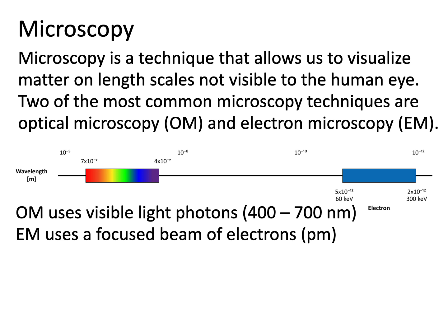Light microscopy uses visible light photons, right? That's between 400 and 700 nanometers on that ROY G. BIV spectrum, whereas electron microscopy behaves in a lot of interesting and similar ways. It's just instead of using visible light and photons, we're using electrons. And the key here is that electrons have a much smaller wavelength.